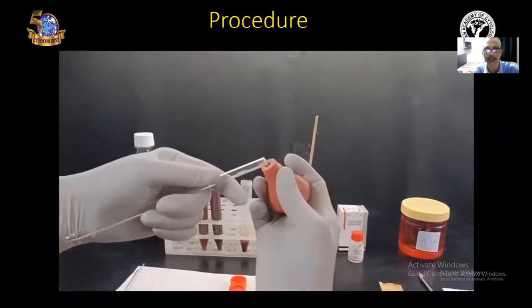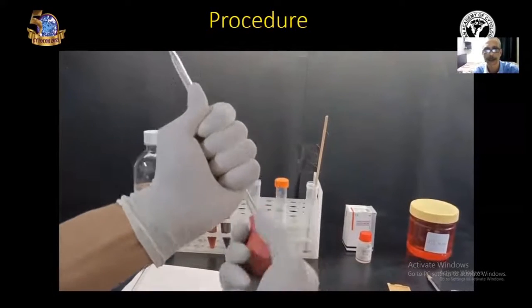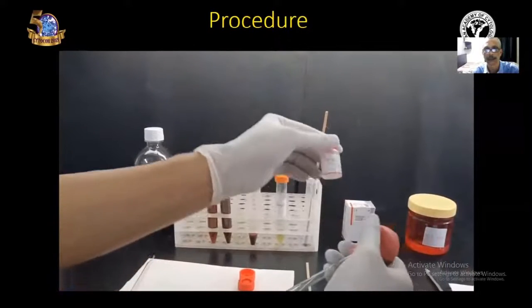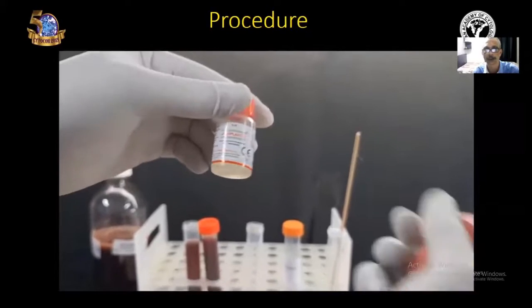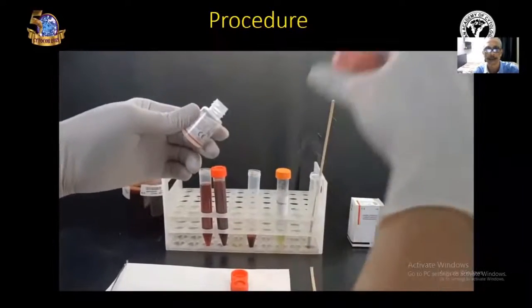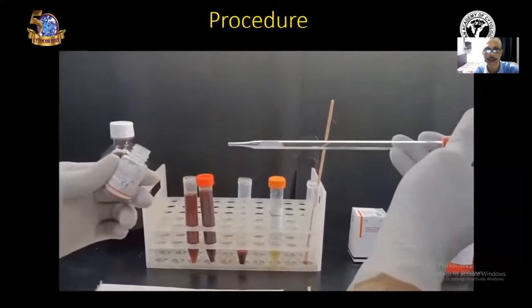Now, next step is adding the thromboplastin. Take another Pasteur pipette and add three drops of thromboplastin. Open the thromboplastin bottle slowly and put three drops of thromboplastin into the sediment.